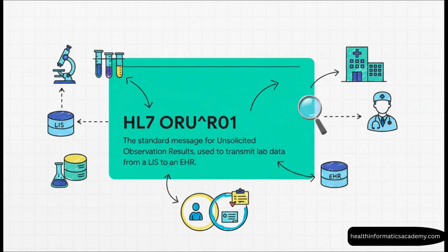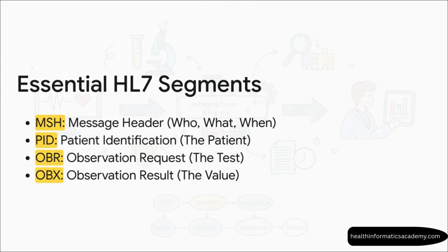You can think of it as the standardized digital envelope that carries the result. Our job is to build a system that can open that envelope and understand everything inside. Inside that envelope are different sections, called segments. And for our purposes, 4 of them are absolutely essential.